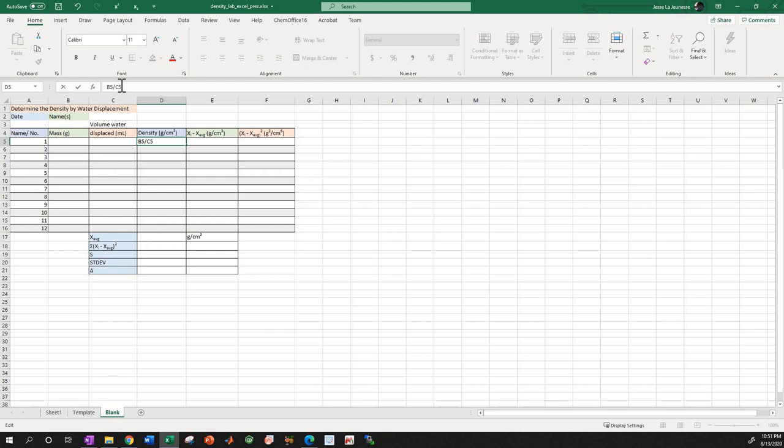Bear with me. Let's say you know when you type in a calculator, you're not sure if this would be B5 divided by C5 times D5. You don't know if, is this B5 divided by C5 and then times D5? Well, you can uncomplicate this by using parentheses.